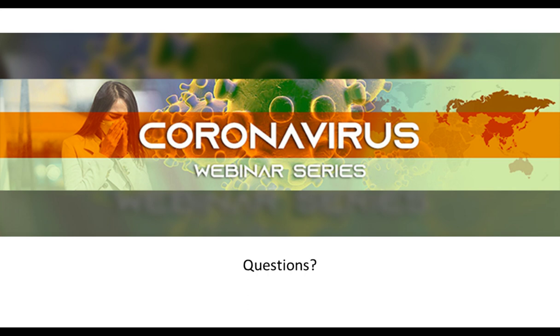As I alluded to in my talk, the sequencing is really ideally suited for surveillance, meaning we are interested in monitoring the mutations. We are interested in, as was pointed out in the question, the geographic spread of the virus. Practically, it can also be used for detection, but practically, the sequencing is suited for surveillance, where you have a large number of samples that need to be analyzed or sequenced, but there is no real-time pressure, because the sequencing takes significantly longer than real-time PCR. So let's say it takes about 20 hours from sample to report.